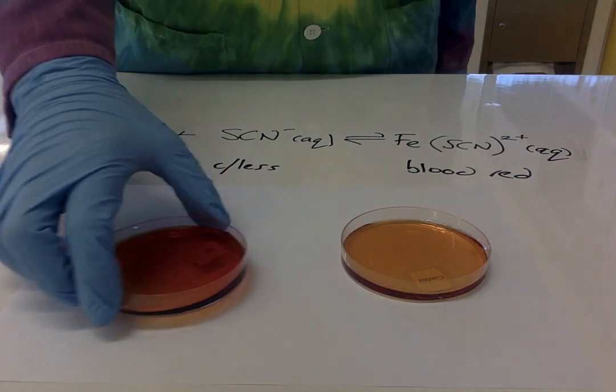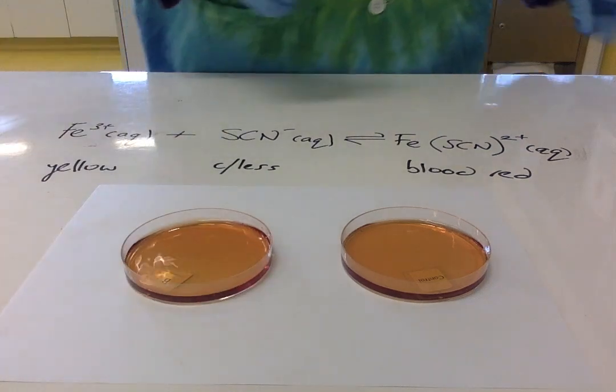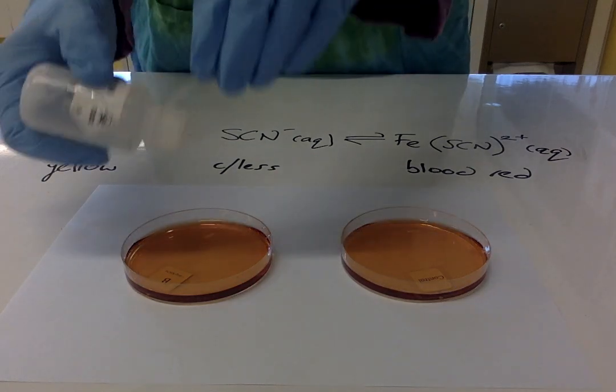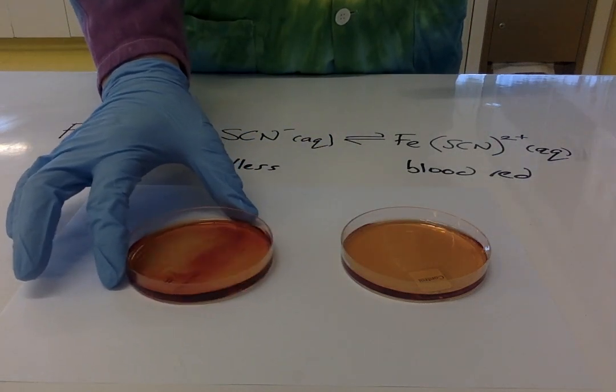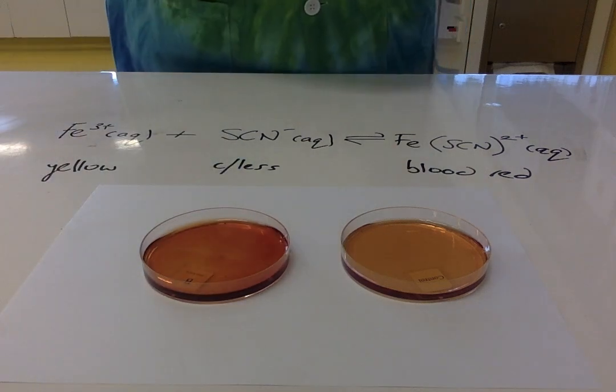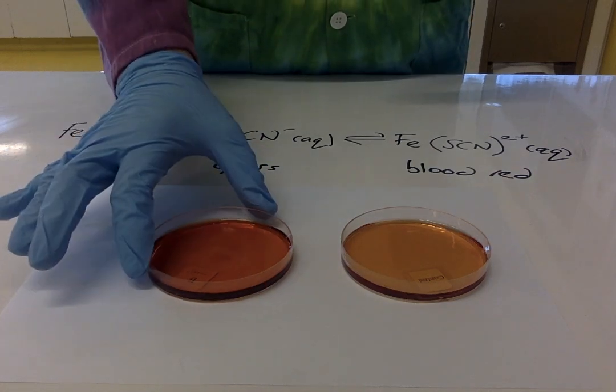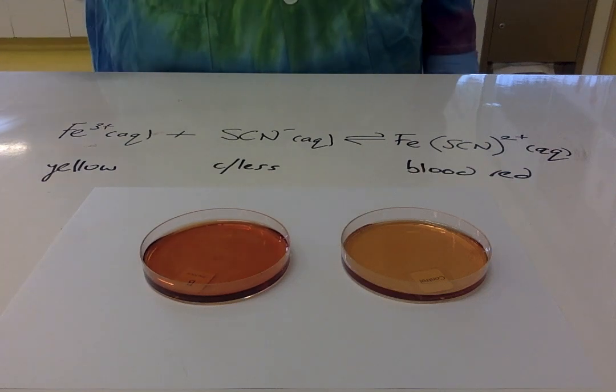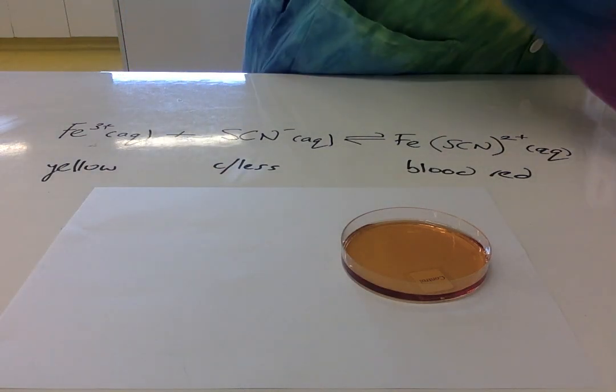The next test I'm going to do is to add some potassium thiocyanate, so adding thiocyanate ions. Again, you can see a distinct darker red color appearing, so you get an equilibrium shift to the right to use up the extra thiocyanate ions.